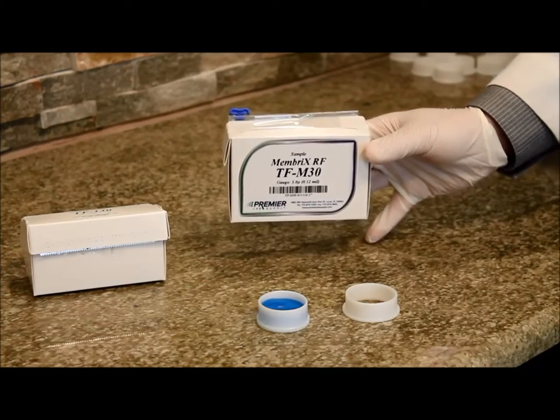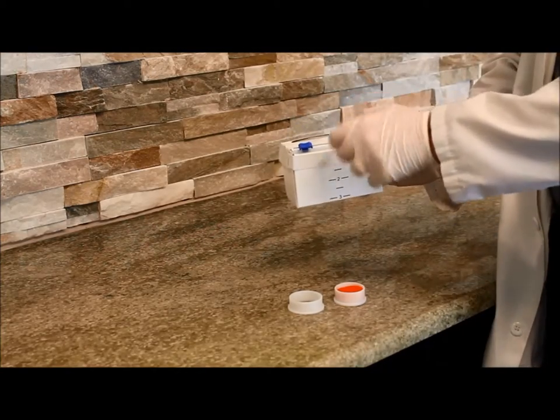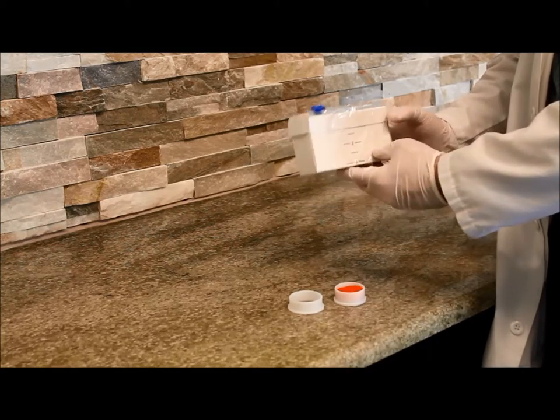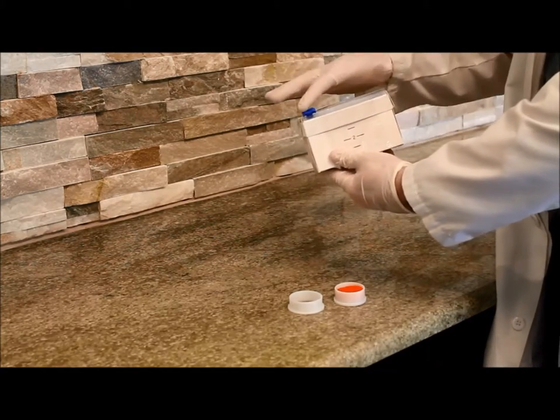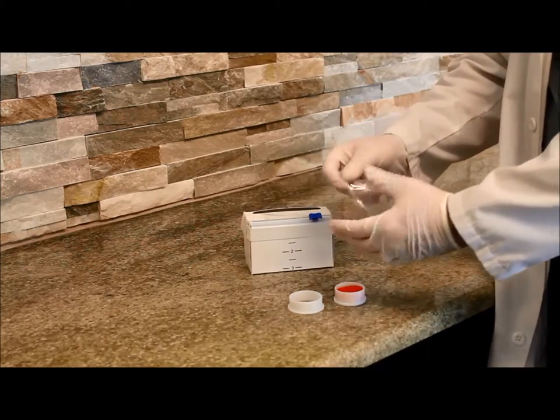The design of the Skybox film dispenser prevents unwanted contamination after dispensing the film while allowing the analyst to effectively cut the film to length. The dispenser is more ergonomic, safer to use, and gives a clean, even cut every time.